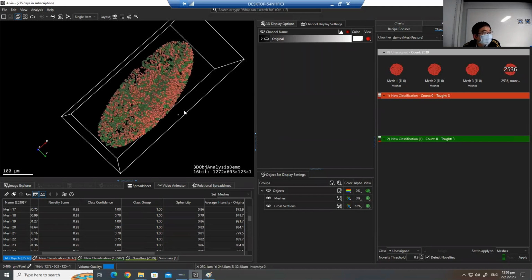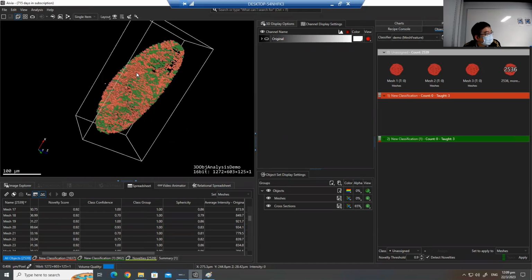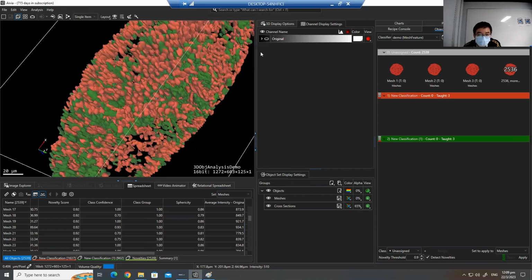Any questions regarding this one? Oh, it's blocking required for the image and our computer. AIVIA installed. Oh, this. Some of them are already answered. Which one?